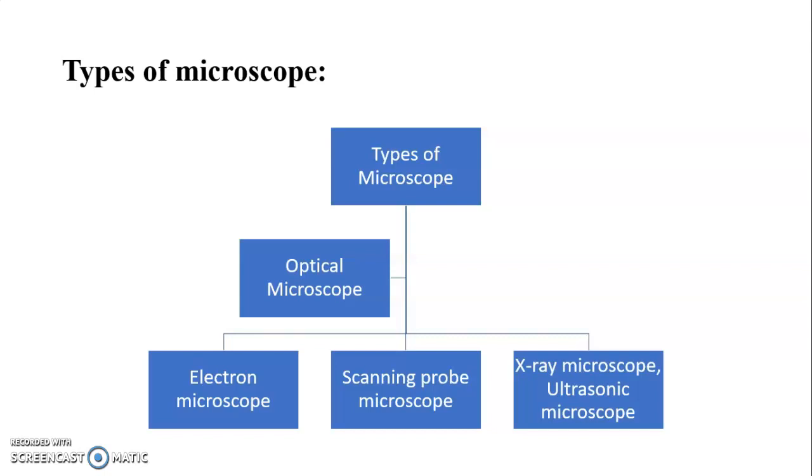It helps in quickly resolving the structure of the specimen. It collects light diffracted by the specimen. And next, that is the eyepiece. The primary image can be enlarged with the help of the eyepiece. The eyepieces are available in different magnifying powers, such as 5x, 10x, 15x.